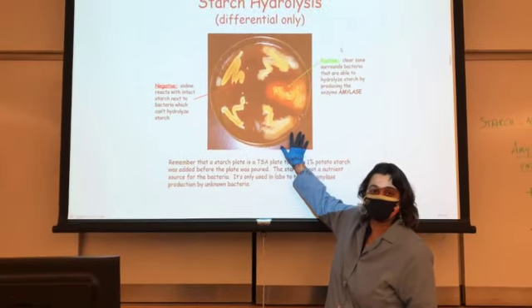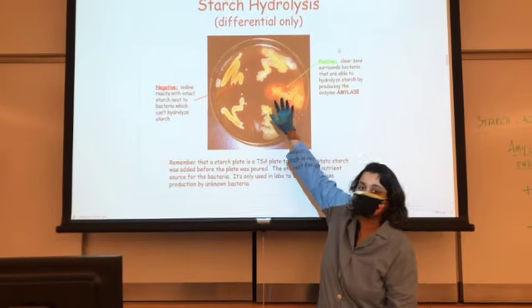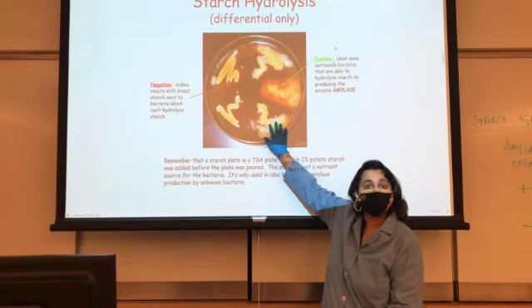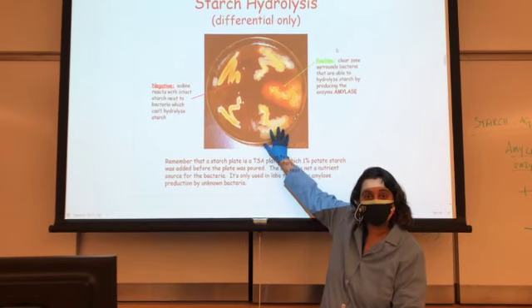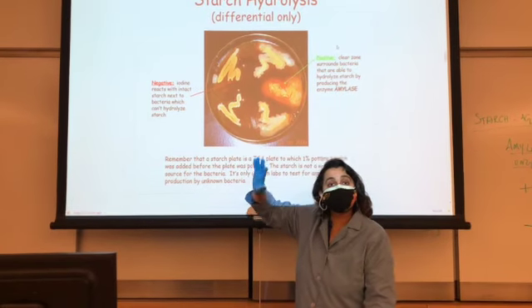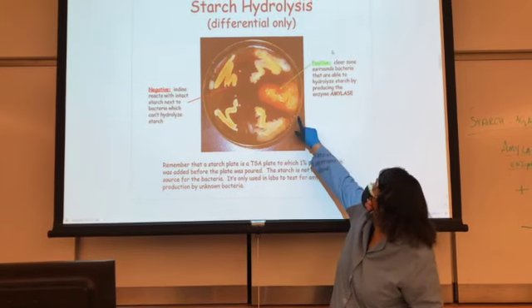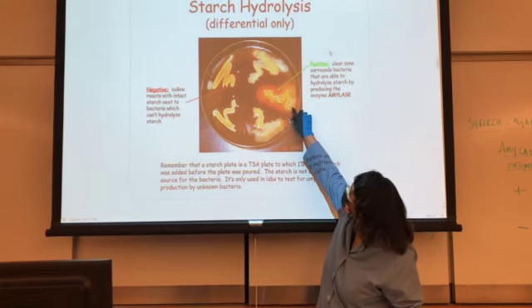So this plate, there are 1, 2, 3, 4, 5, five different bacterial strains. Everything grew on the starch agar plates, and once they grew, what you need to do is add the gram's iodine, the iodine from your gram staining. So once you add the iodine, if you see dark purple color, starch is still there. So when starch is still present, the bacteria has no amylase enzyme. But look at this specific strain. I think this is Bacillus cereus.